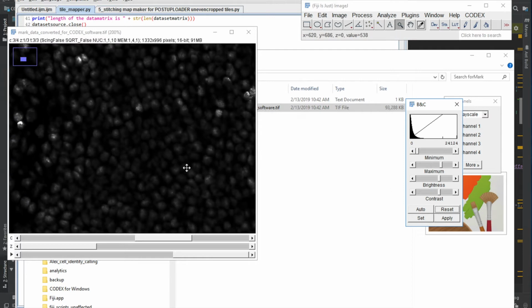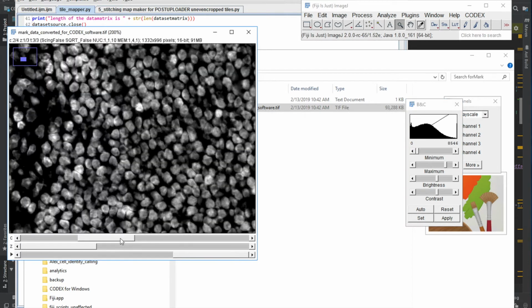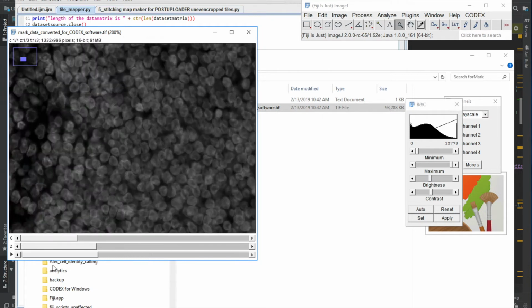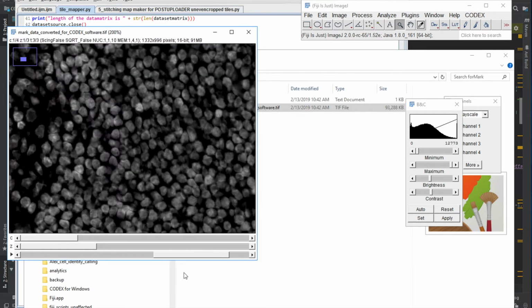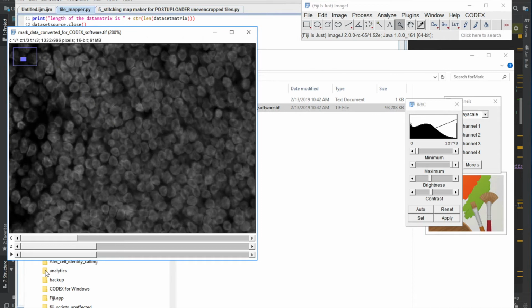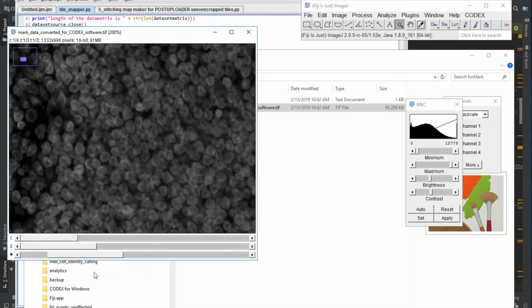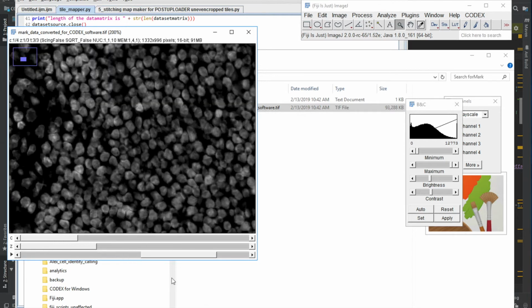But it doesn't do the outlines properly. You want something like this. So if I compare it to the original nuclear signal, so that's your processed data, and that's the original signal, you will see that in the cases where the nuclei look very fused, it kind of tried to diffuse them.